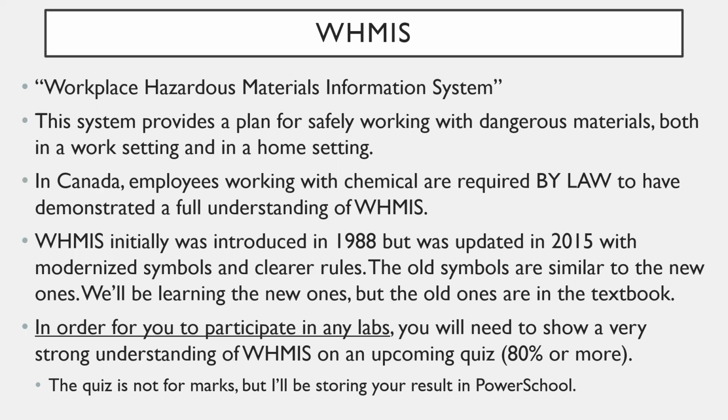Now in Canada, employees working with chemicals are required by law to have demonstrated a full understanding of WHMIS, right? So in other words, if you are working some job where you deal with chemicals, you have to pass a WHMIS course before you're even allowed to enter that workforce.